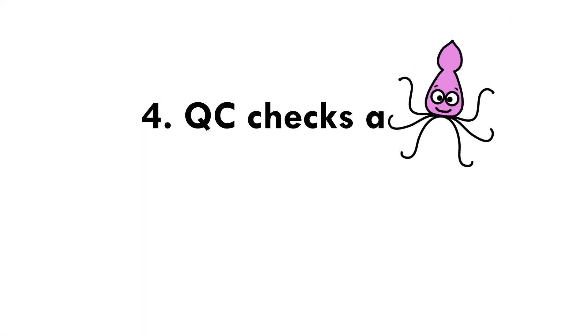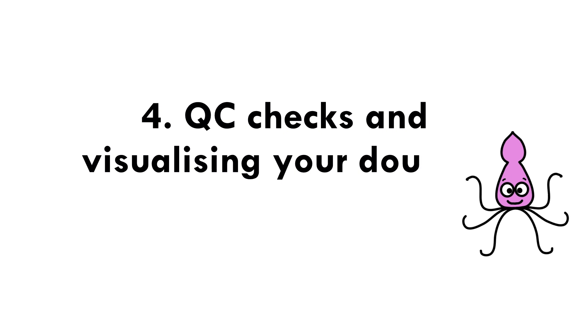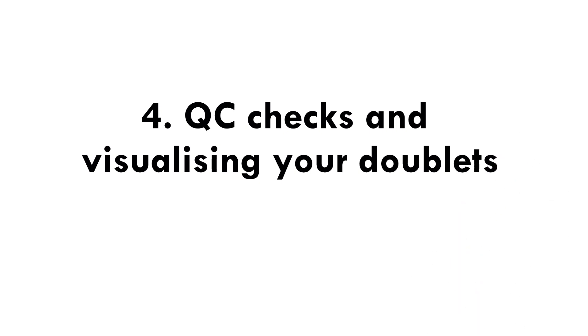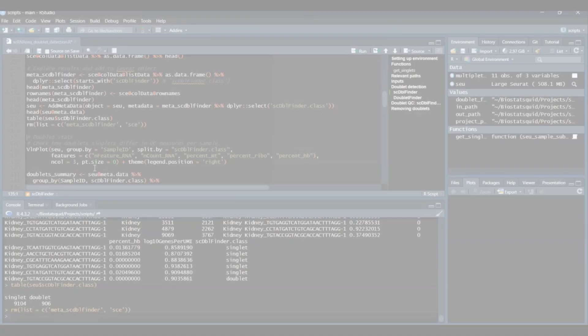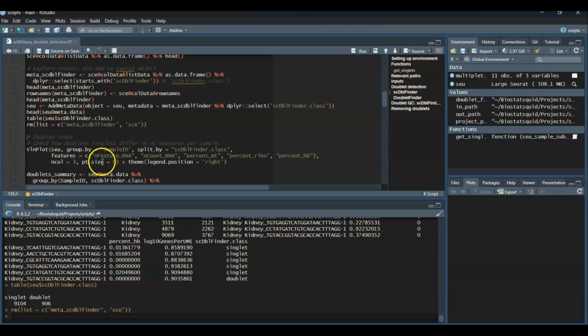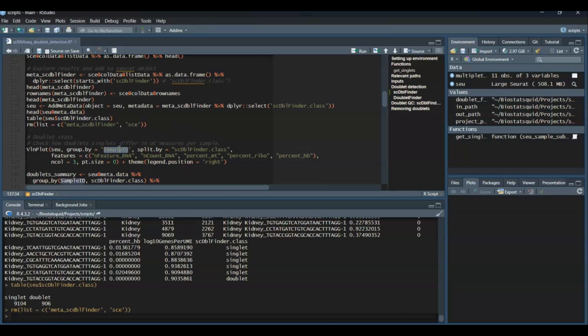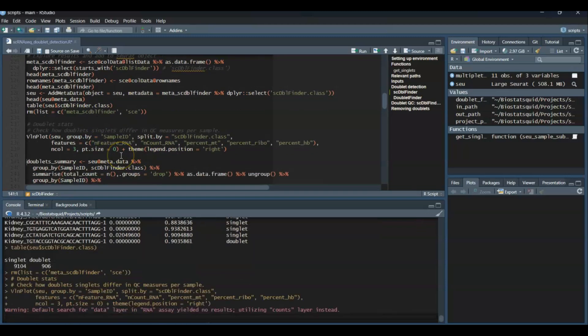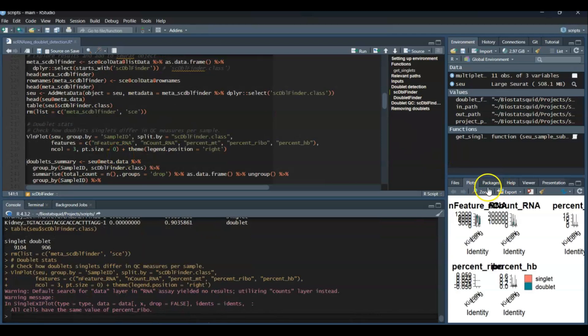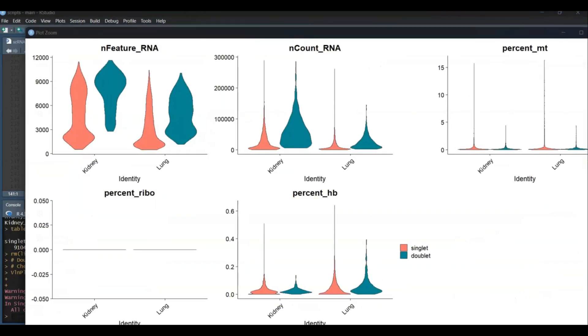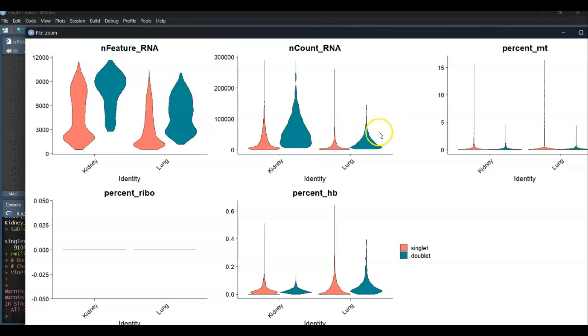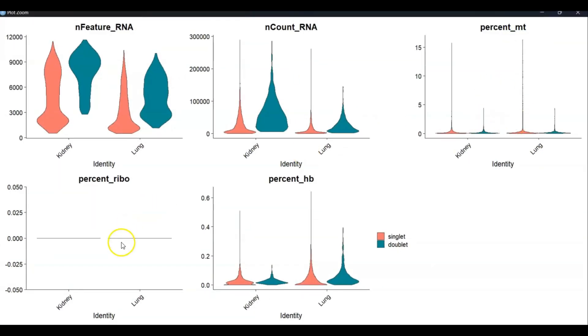Cool, so now we can visualize some stats. For example, let's plot violin plots of quality control metrics. So the number of RNA features, RNA counts, mitochondrial percentage, ribosomal percentage and hemoglobin percentage, split by scDblFinder.class and grouped by the sample ID. So let's run this. This will only give us some rough violin plots. As you can see, doublets seem to have a higher number of genes and read counts in general. But we don't expect big difference in the mitochondrial percentage or the ribosomal percentage. So that can be a quick quality control check.